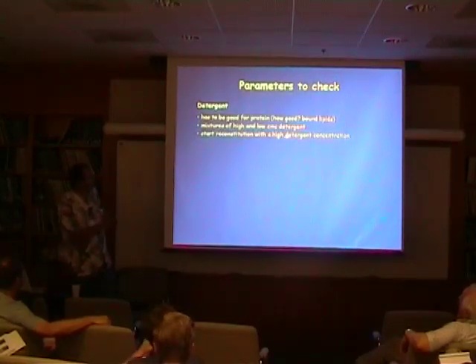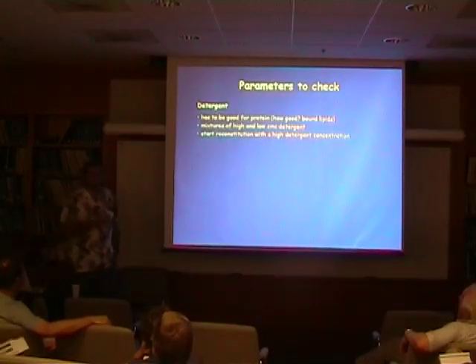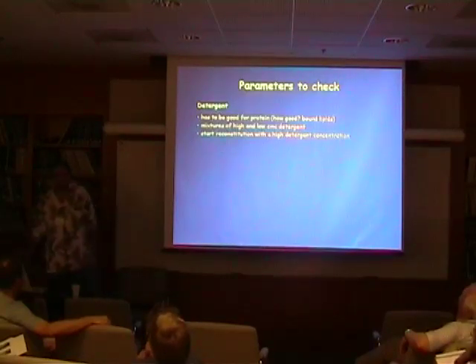And the other thing that people came up with, these are just statements that I have from the literature or from different conversations, is that people feel that if you start with a high detergent concentration, you get better 2D crystals. Again, it doesn't make much sense to me, because up to the CMC, I don't see why a lot of detergent would make a difference than little detergent. When it really happens, it's when you reach the CMC, and that's pretty much, doesn't matter with how much detergent you started. So this is my view, but this is really up for discussion, because there are different views around.